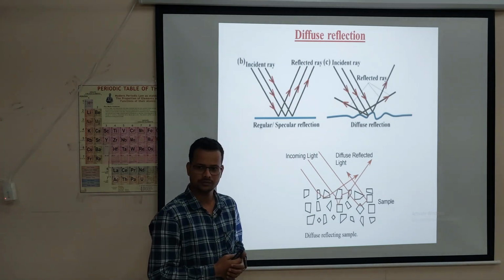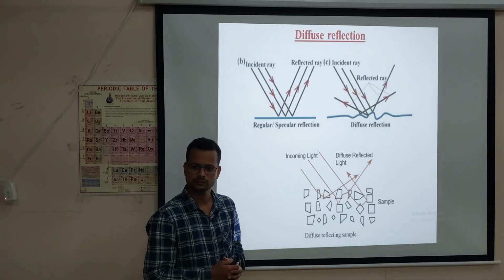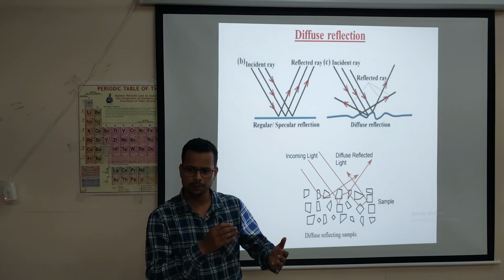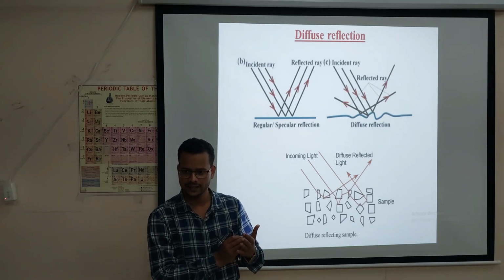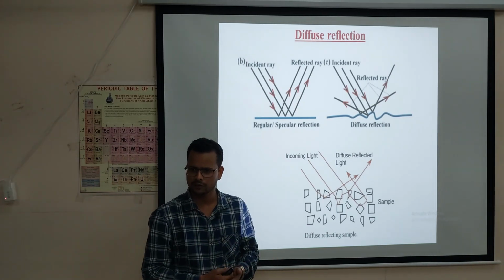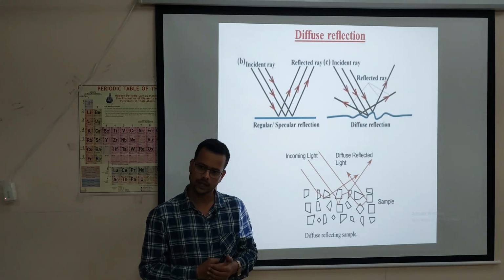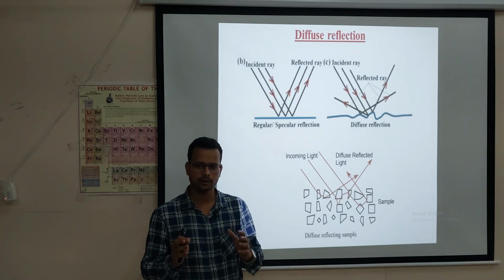Got it? In a mirror there can be reflection; in a sample, how does it get reflected? You can take anything: 100% light cannot be absorbed and 100% light cannot be reflected. In a mirror, 90 or 95% reflection occurs, while here 10 to 15% reflection will occur, but reflection will occur. Some materials may not reflect, but what about a black body?